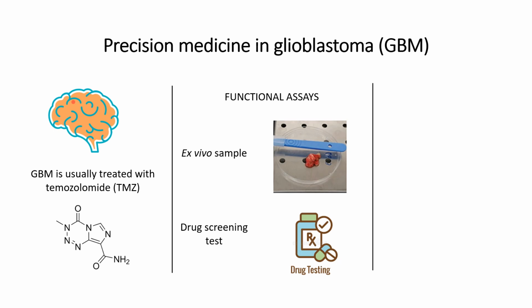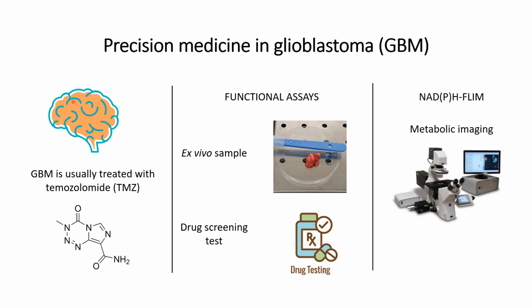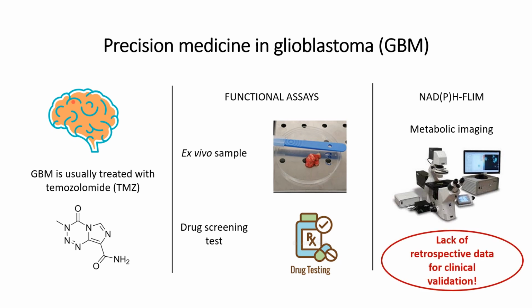Among the functional assays, in our work we will focus on a very promising one, the Fluorescence Lifetime Imaging Microscopy, which is an imaging technique to detect metabolic changes in a tumor sample. Importantly, these changes are directly correlated with early treatment response. However, as many functional assays, it lacks retrospective data, limiting its clinical translation.